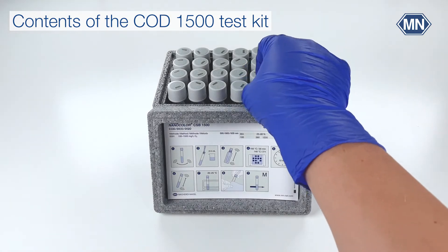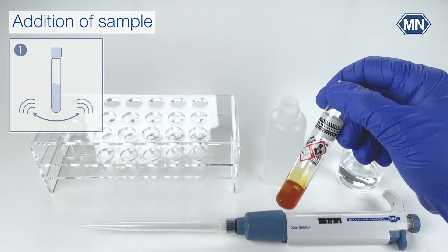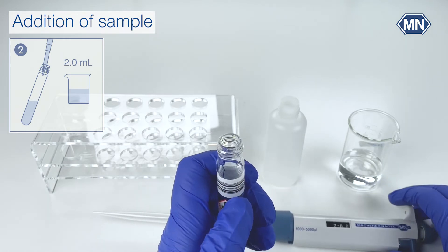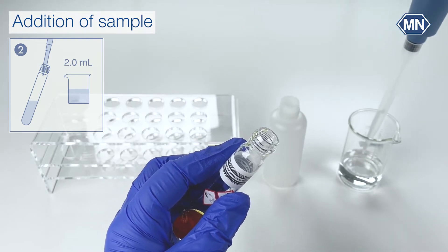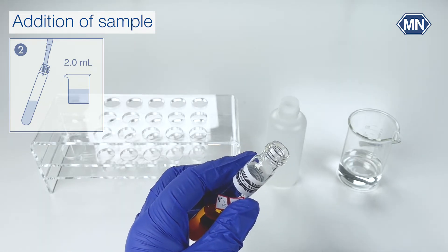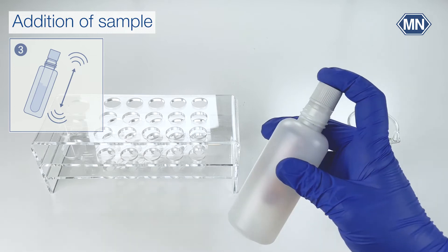The test contains 20 test tubes for the determination. Swirl the cupboard to bring the sediment into solution. Open the test tube and hold it at a 45 degree angle. Carefully add 2 milliliter of the sample. Place the test tube into the safety bottle.